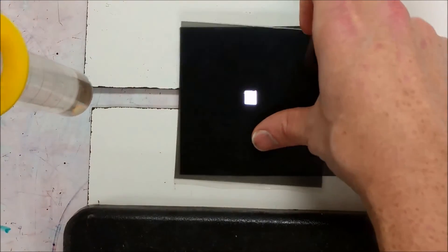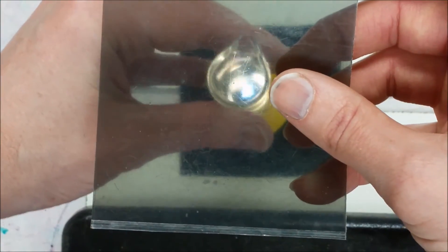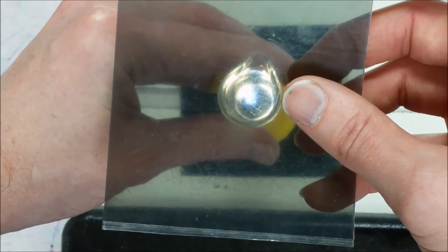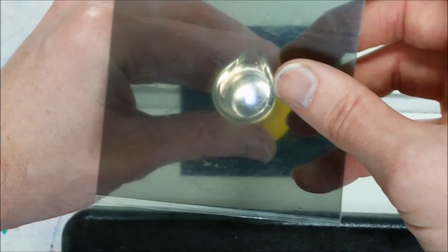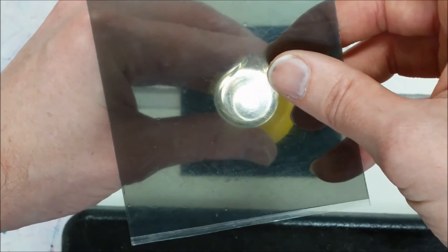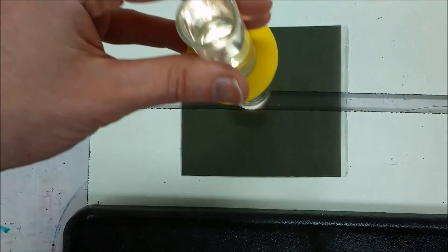So when I put this in between the two filters, so currently here is the filter without that, what you're going to see is that there's going to be a rotation of that plane. So now, when I rotate this, it's going to change from being where it is now, to being slightly darker.